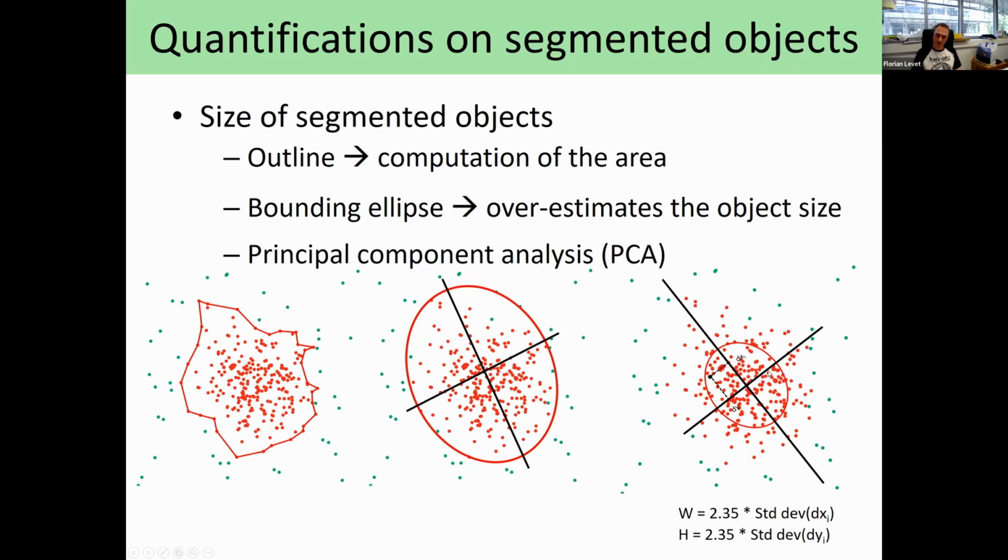You can compute the perpendicular frame here, and then you will take each one of your localizations and project to the 2 lines. So you will have a distance in y and a distance in x for each of the localizations. You do the distribution for x and for y, and for z if you have a 3rd dimension. You find the standard deviation and you multiply by 2.35.